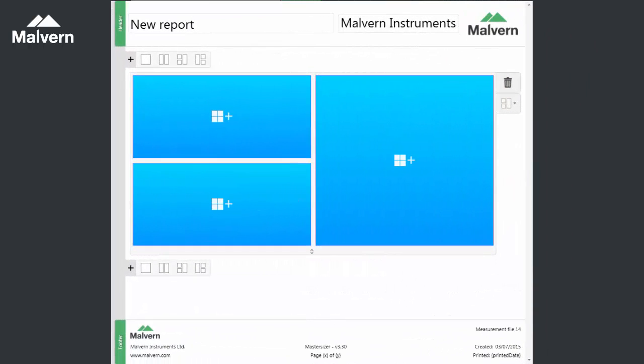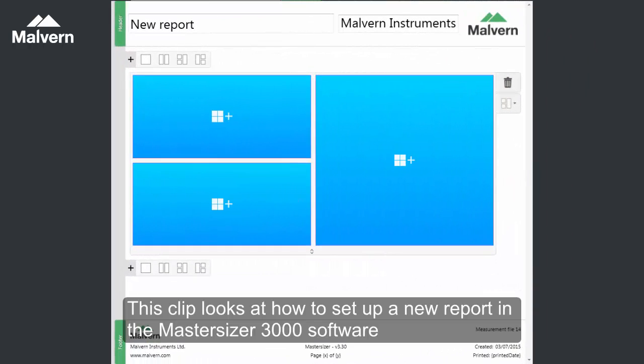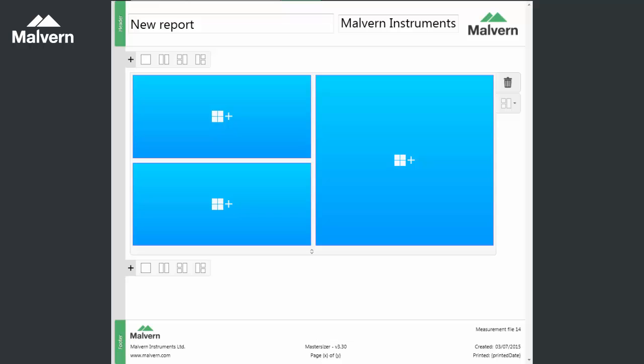In this clip we will look at how to create a new report in the Mastersizer 3000 software. This will cover the different items or widgets that you can add to reports and how you can configure the report to look the way you want it to.